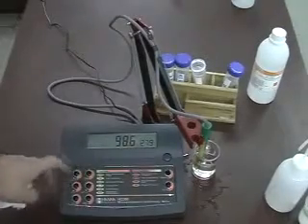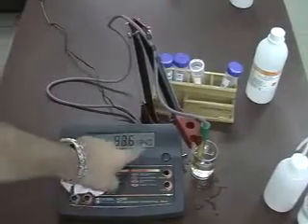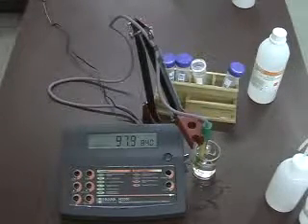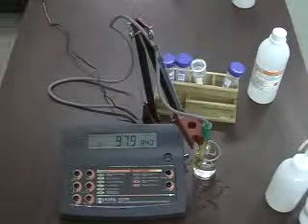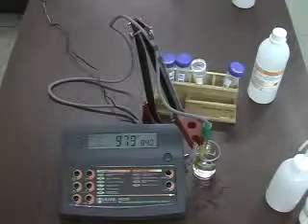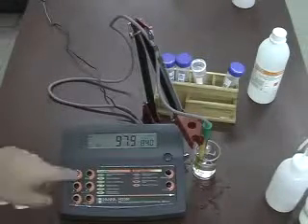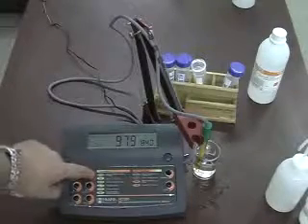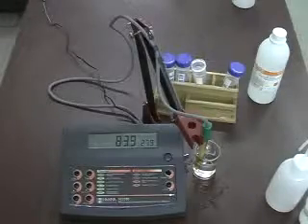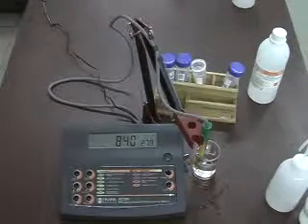And I can tell the meter that this is 84 microsiemens solution by simply pressing the cal button. It's prompted me for 84 microsiemens solution. After it sees a stable measurement, it will lock on that measurement and we will hit confirm again. Again, I will press the confirm button, and now I just told it that it's 84 microsiemens, and there is a chance that that is not truly 84 microsiemens just by the contamination within the probes, but it is going to be relatively very close.